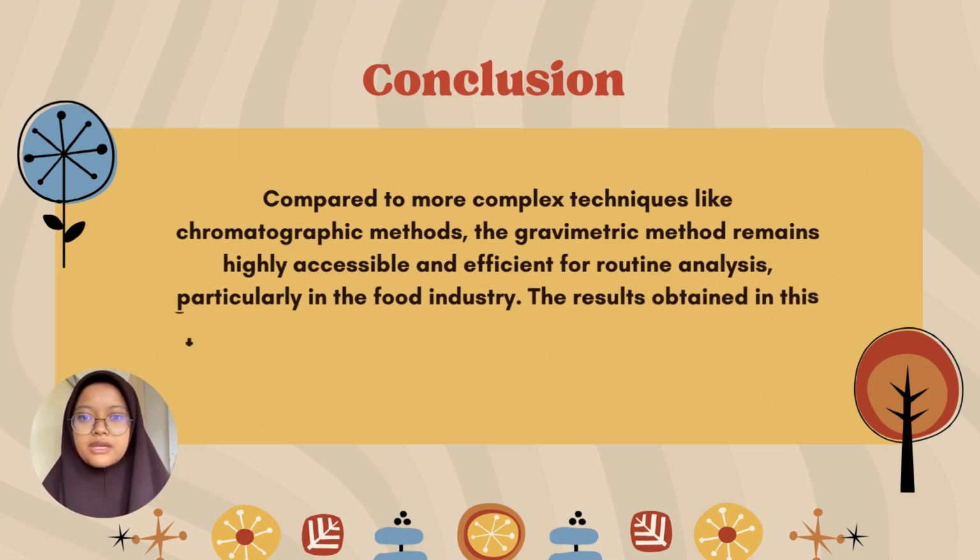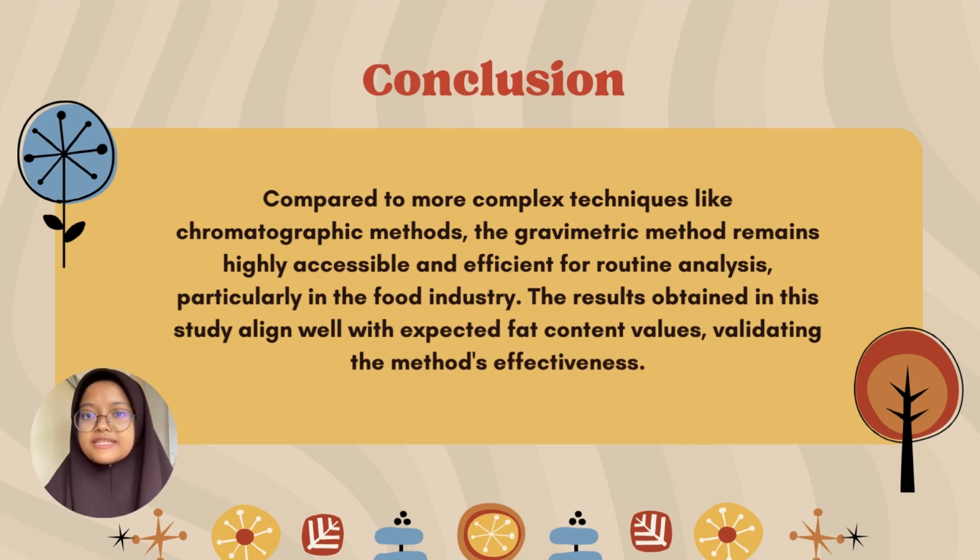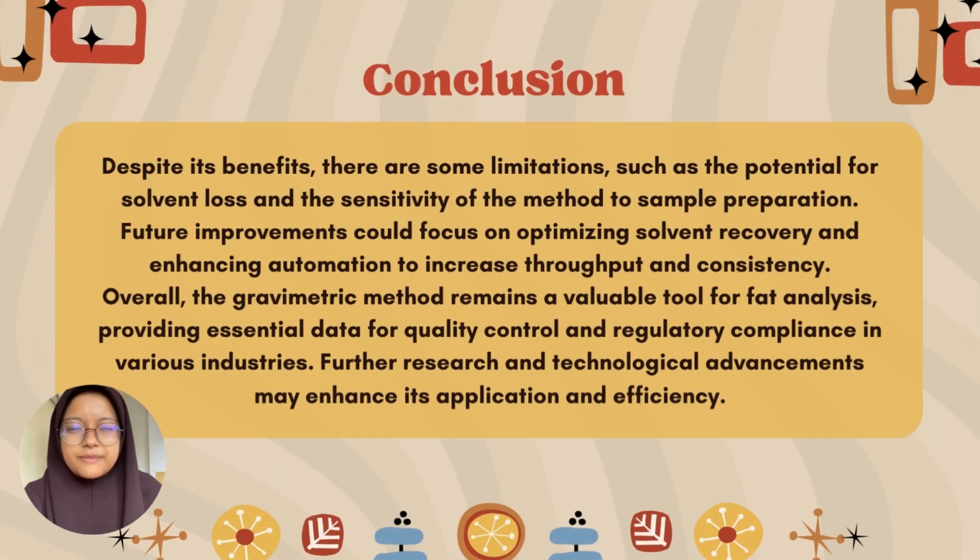in the food industry. The results obtained in this study align well with expected fat content values, validating the method's effectiveness. Despite its benefits, there are some limitations such as the potential for solvent loss and the sensitivity of the method to sample preparation. Future improvements could focus on optimizing solvent recovery and enhancing automation to increase throughput and consistency. Overall, the gravimetric method remains a valuable tool for fat analysis, providing essential data for quality control and regulatory compliance in various industries. Further research and technological advancement may enhance its application and efficiency.